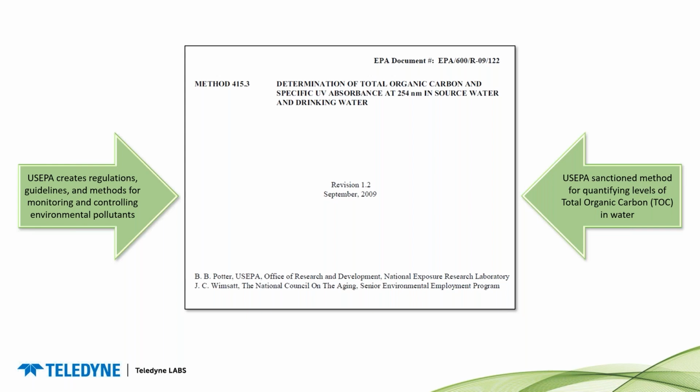One of the many tasks of the EPA was to create regulations, guidelines, and methods for monitoring and controlling environmental pollutants. And of the numerous methods established, Method 415.3 is the US EPA sanctioned method for quantifying levels of TOC in water.